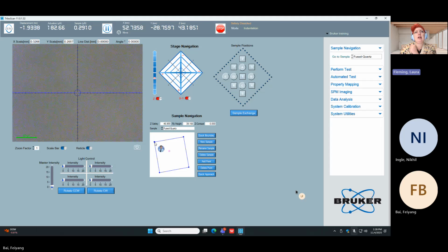So to be clear, this is not normal. We're checking the sample zones to make sure they're still correct after the software update. It was a small software update, so I'm okay with reusing the sample zones, but I need to verify first that they are still correct. The reason I was noting the Z focal height on the aluminum is that I thought it was out of focus for a moment.